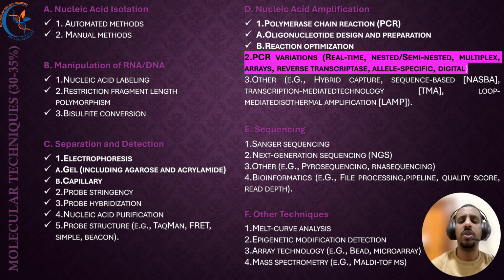So today we'll continue in the fourth section of molecular techniques, nucleic acid amplification. Our focus for this session will be on PCR variations, a cornerstone of molecular biology diagnostics and a high-yield topic for the molecular biology ASCP exam.